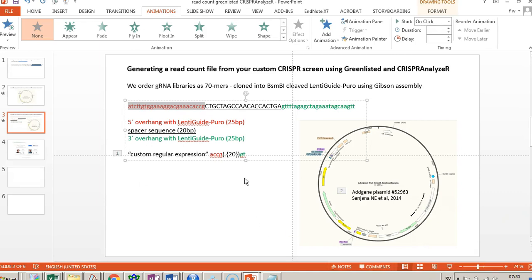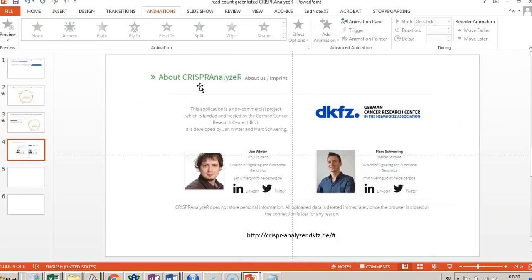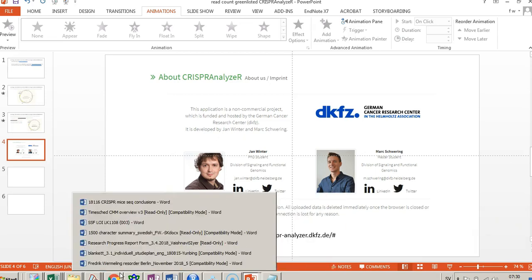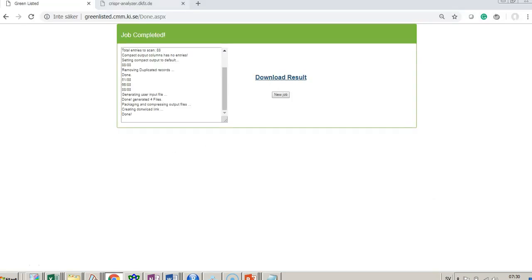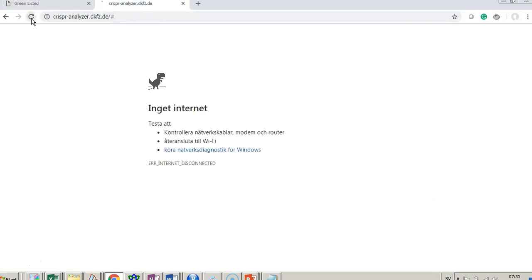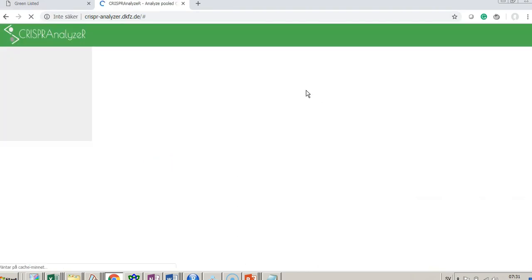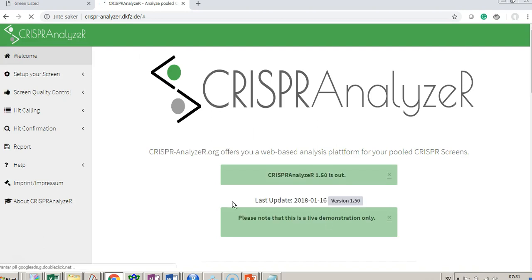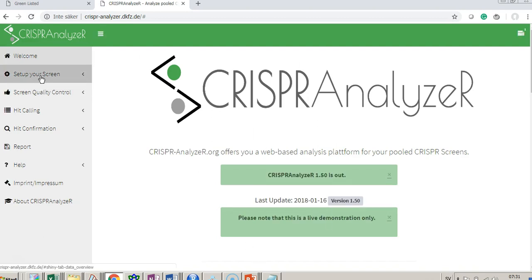To get out the actual read counts — the representation of each guide — we're going to use CRISPR Analyzer. This has been developed by a great team; I have no affiliation with them but highly recommend it. The software interface looks like this and there's a lot of information here.